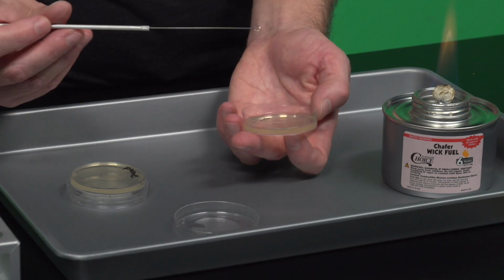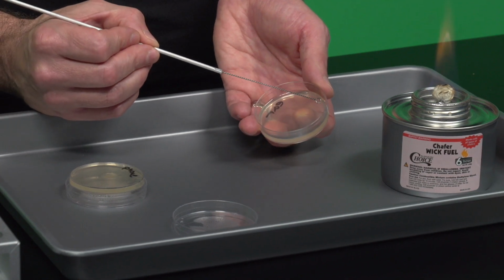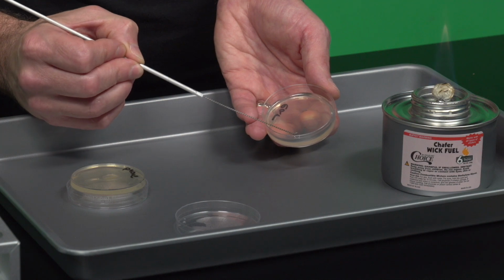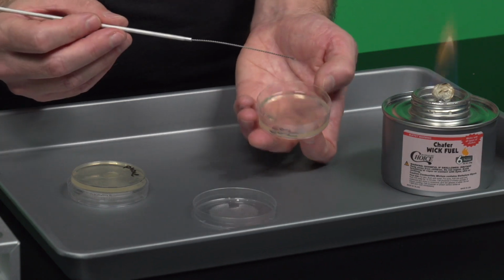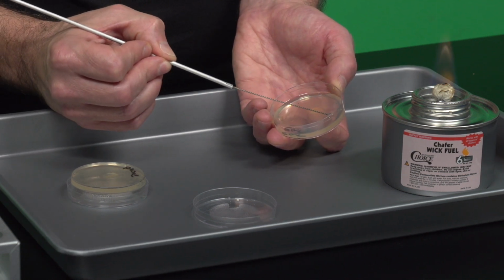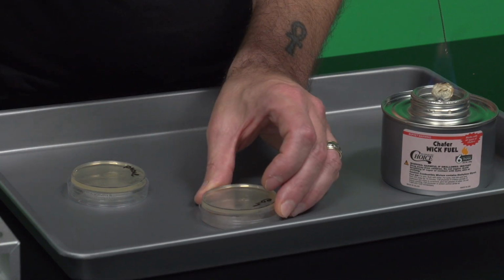You would wait 20 seconds, and then you would go and start from quadrant 2 into quadrant 3, 2, and then I'm just going to stay in 3. Okay? And then what I would do is I would flame, and then I would go from quadrant 3 to quadrant 4, and basically I'm just going to go ahead and stay in that. And so what I'm going to do is sterilize this loop before I put it away.